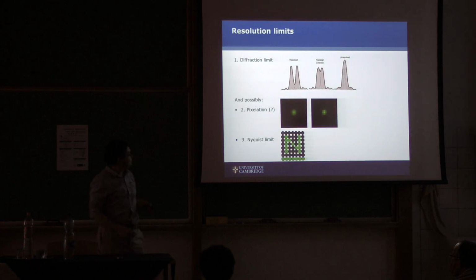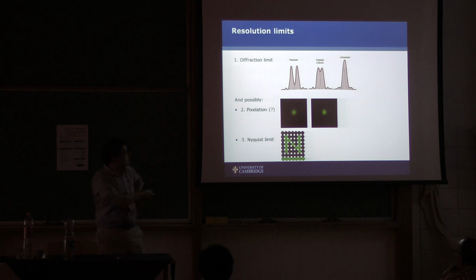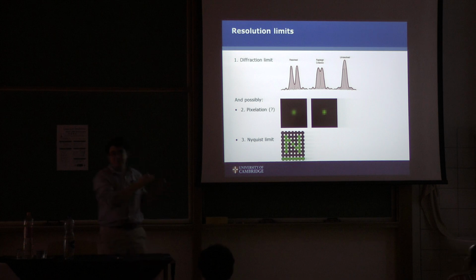Okay. And then I have a few slides about super resolution and why there is diffraction limitation. I will just go through them very quickly, because as Miklos says, the fundamental problem that we're looking at is the diffraction limit. That is, no conventional optical imaging system can allow us to resolve features which are smaller than about the wavelength of light. So features smaller than about 300 nanometers, we cannot resolve. This is because of diffraction-limited blurring.